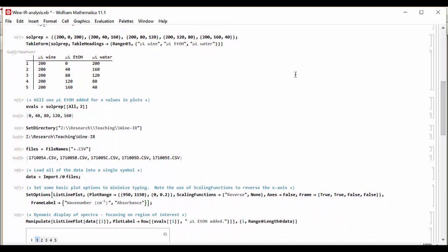What I'm showing here is how we could analyze these data using Mathematica, and so I'll walk through my notebook here on how I solve these. We'll try to pause so that you could pause the video and type the information in yourself, but I want my students to learn how to do this on their own, so I'm not providing the actual Mathematica notebook.